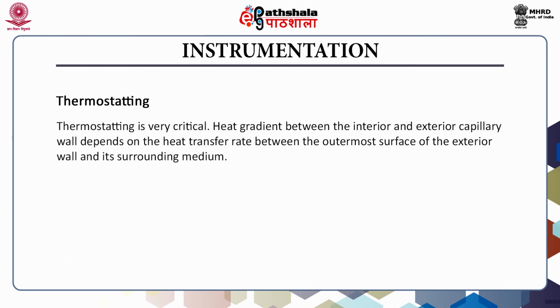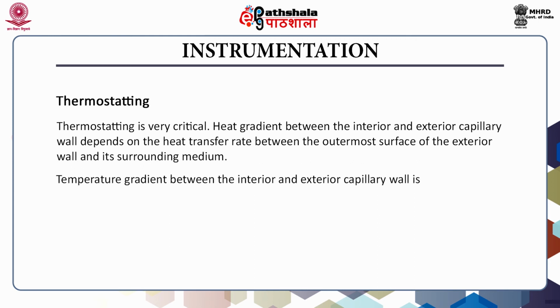Thermostating is a heat dissipation mechanism which is very crucial for capillary gel electrophoresis. There should be minimum heat gradient between the interior and exterior capillary wall. This depends on the heat transfer rate between the outermost surface of the exterior wall and its surrounding medium. The temperature gradient between the interior and exterior capillary wall is about 125 degrees centigrade per millimeter when air is the surrounding medium.